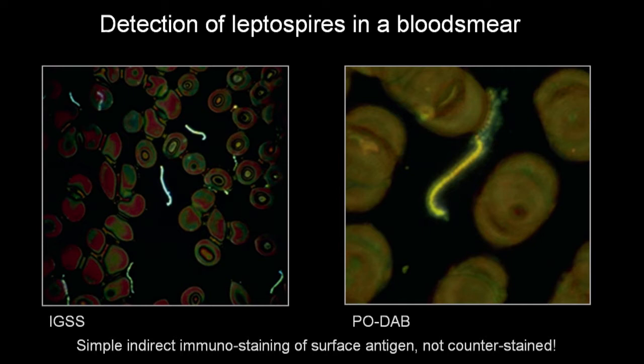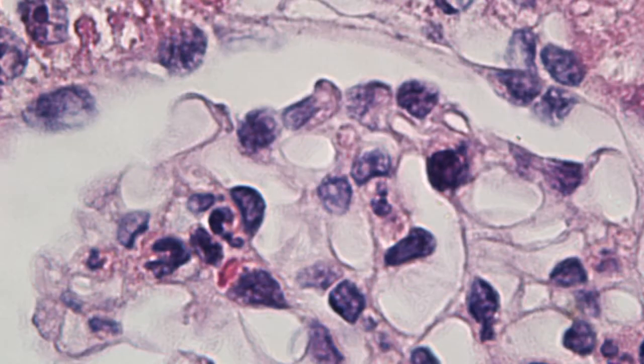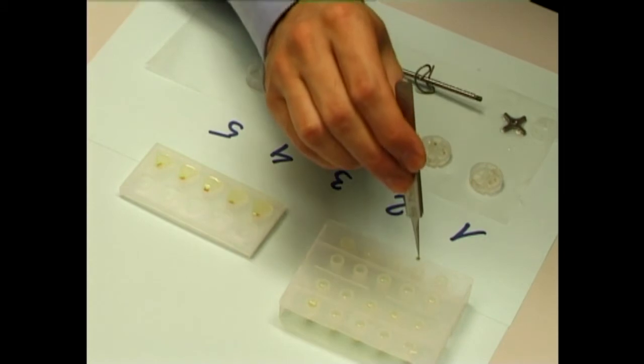Special attention is paid to small biological objects that have to be processed for RCM. If you encounter the limits of bright field microscopy, the resolution, sensitivity or handling of specimen, RCM can be a feasible option.